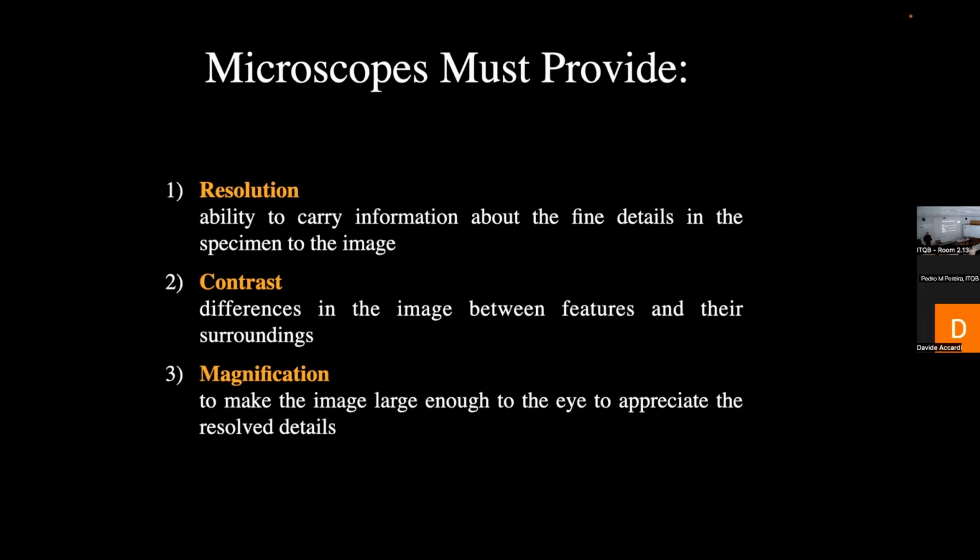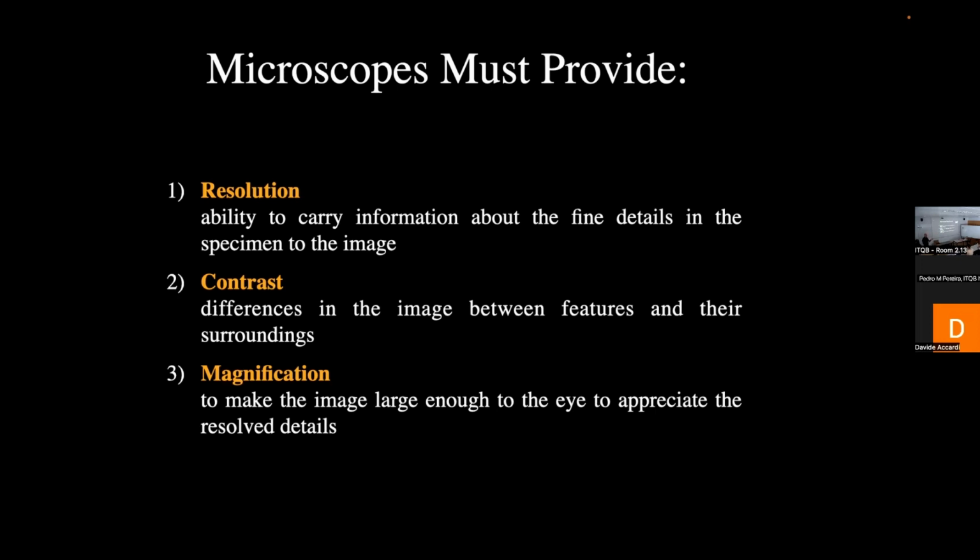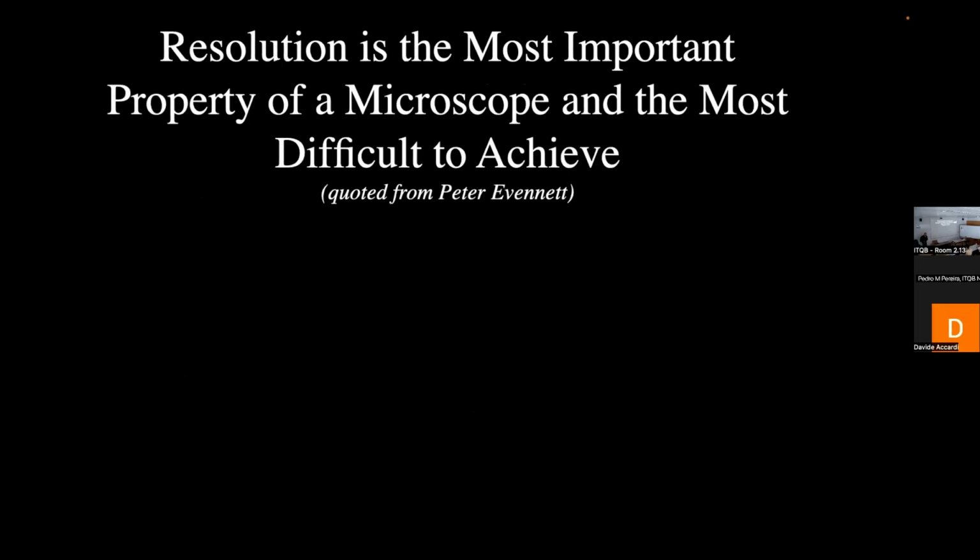But if the tiny details are not there, magnification will be completely empty. You can enlarge an image enormously, but if you see only square pixels in your details, then magnifying will not give you any further information, right? All right, so let's have a look.